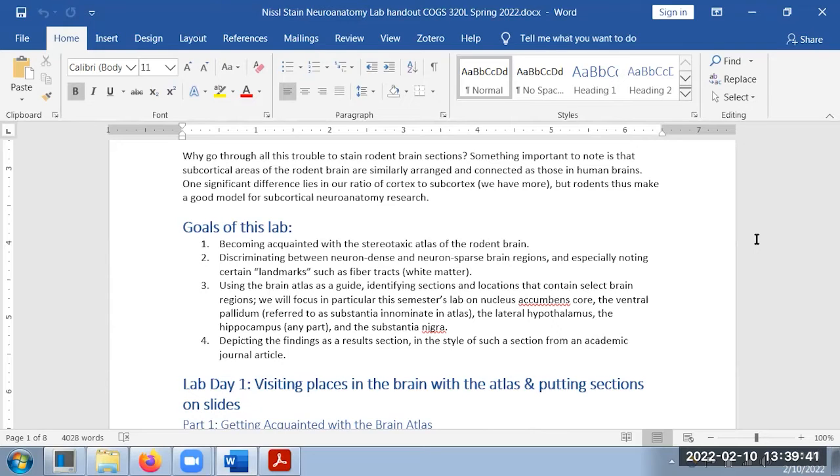Take pictures of those, and then for the assignment, draw boxes around the areas of the pictures where they exist. The boxes don't need to be hyper exact. I do have a margin of error built into how these things are graded and corrected, so people don't have to worry about it unless they're looking at the totally wrong end of the brain or something. So I think that people are going to be a little bit good at knowing generally where to find these things.